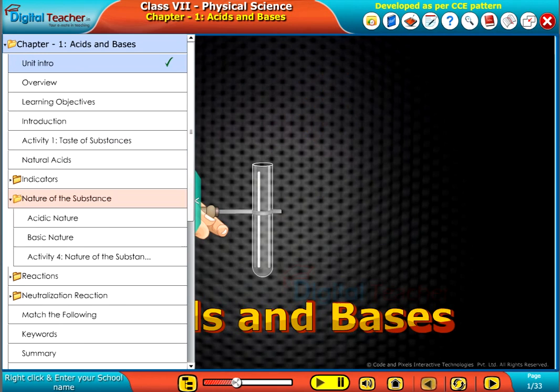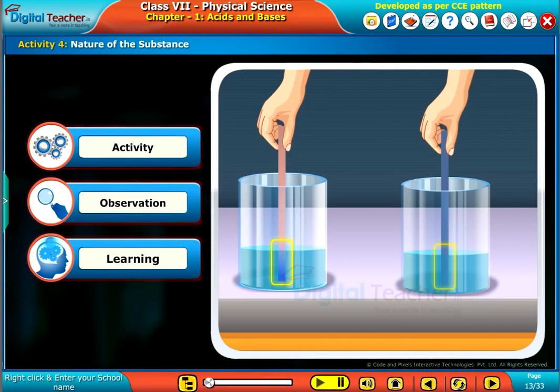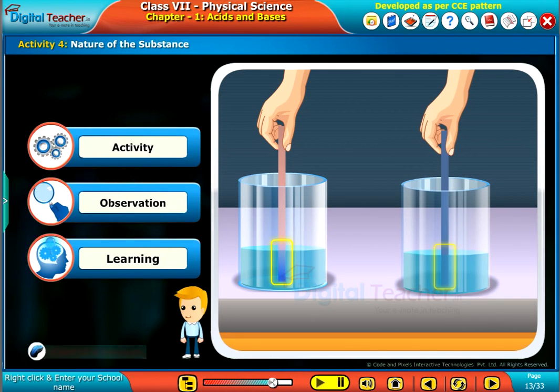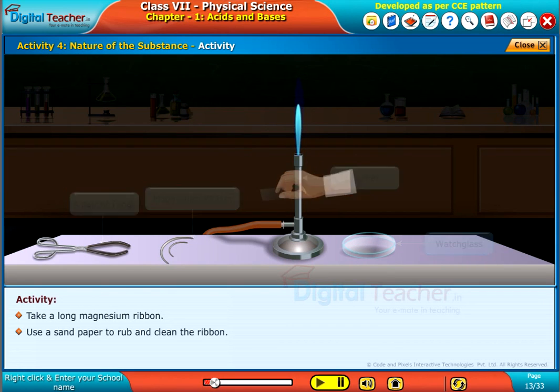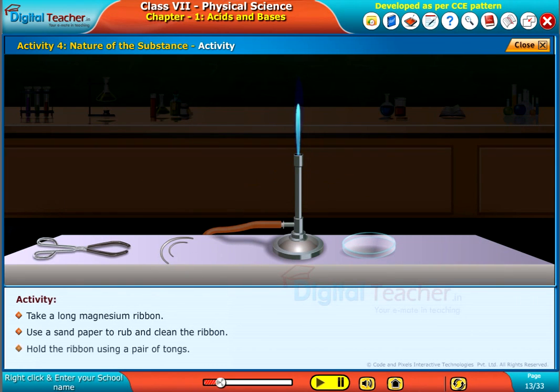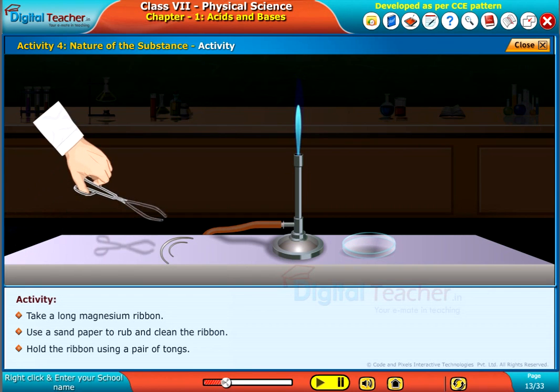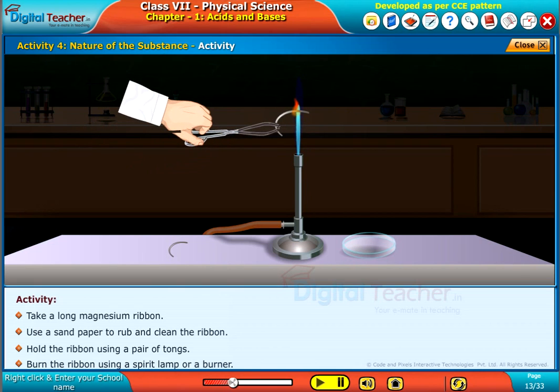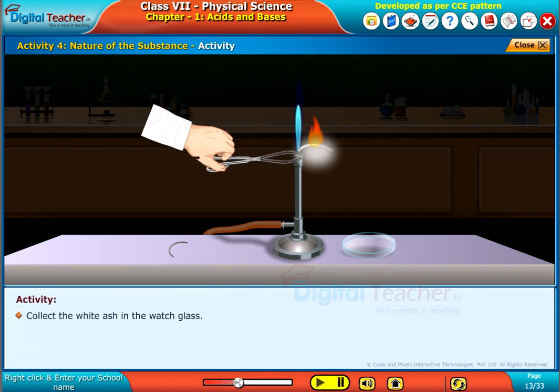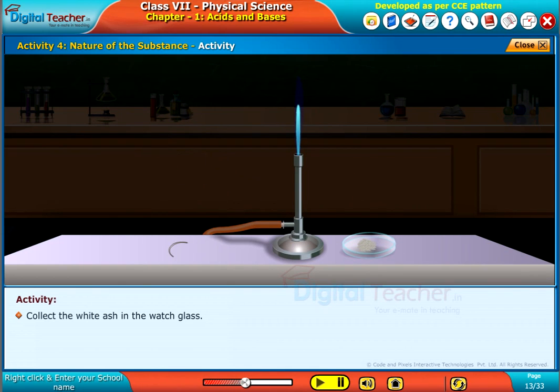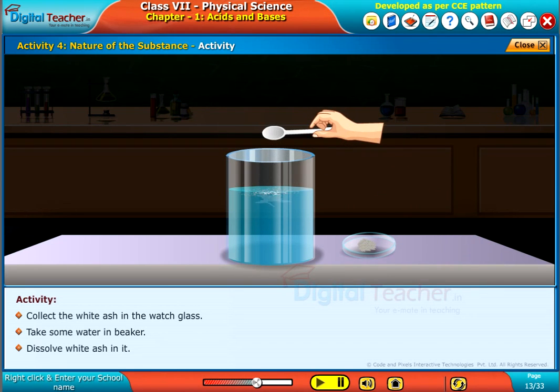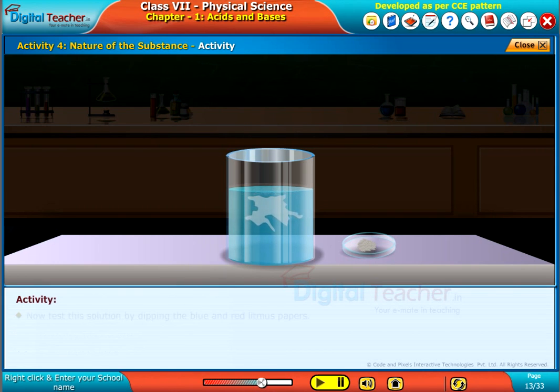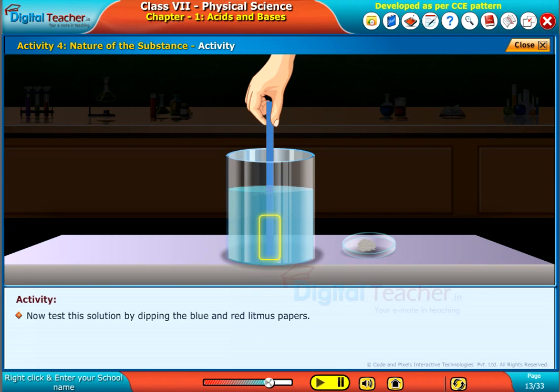Welcome to the chapter Acids and Bases. Here, let us perform an activity to know about the nature of substances. Take a long magnesium ribbon and use sandpaper to rub and clean it. Hold the ribbon using a pair of tongs and burn it using a spirit lamp or a burner. Collect the white ash in a watch glass, take some water in a beaker, dissolve the white ash in it, and test the solution by dipping blue and red litmus papers.